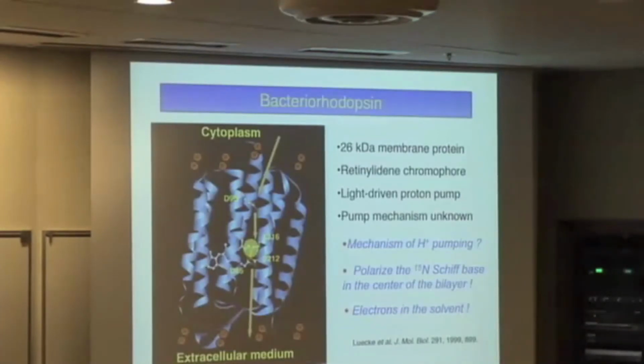and this is a question that's come up on 5 or 6 of my NIH grant reviews. So people ask it quite a lot, and it's a reasonable question to ask. Well, what happens is there's a phenomenon called proton spin diffusion.